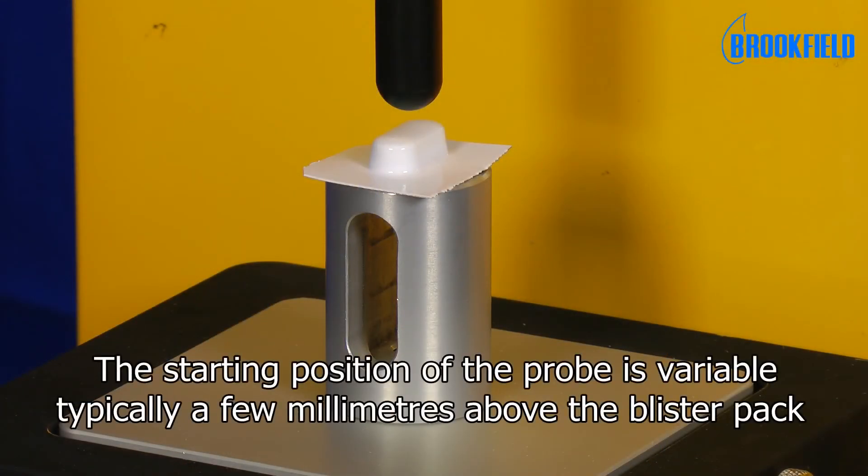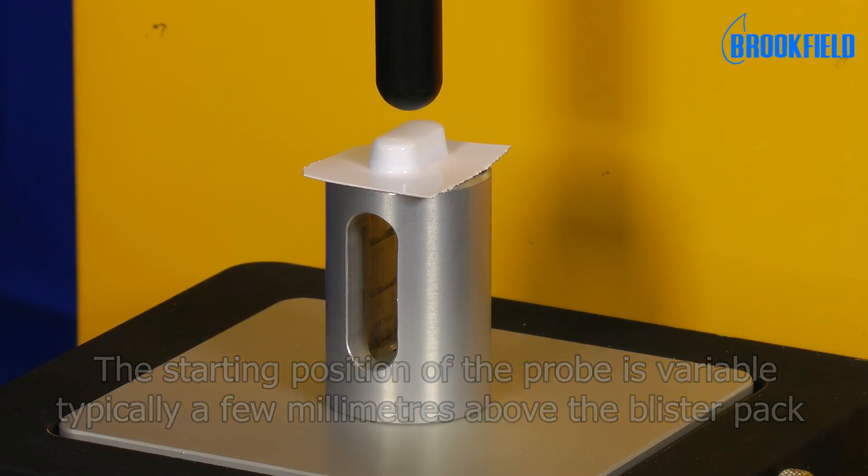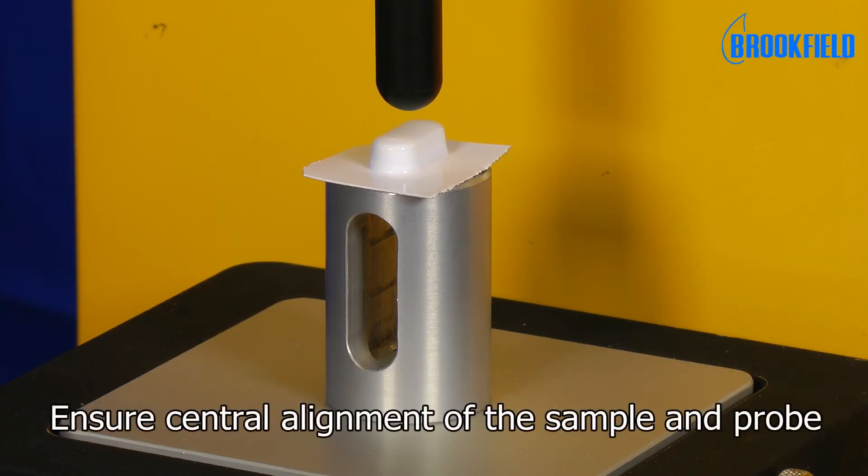The starting position for the probe can vary, typically a few millimeters from the blister pack. Also ensure that the blister pack is centrally under the probe.